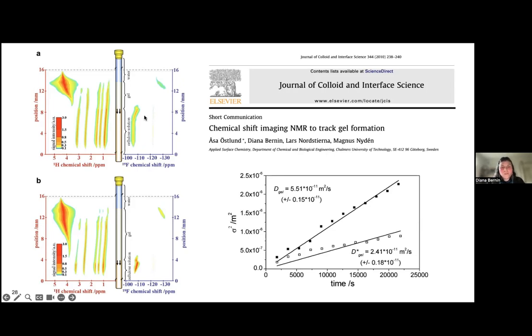In this probe, we could not. I don't think we have recorded it in the same run. So we had one run measuring the fluoride and one run measuring the proton. But there are probes, or consoles, I would say, hardware, where you can measure fluoride and proton at the same time.